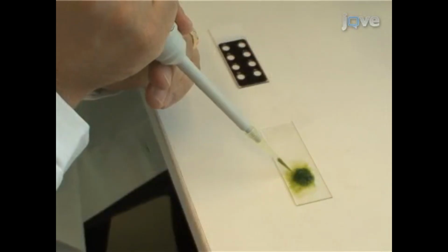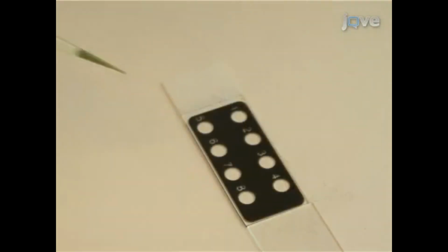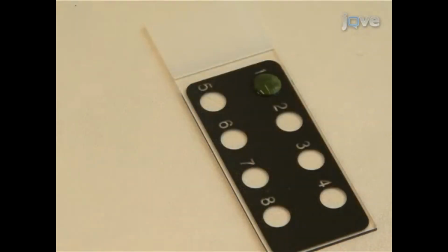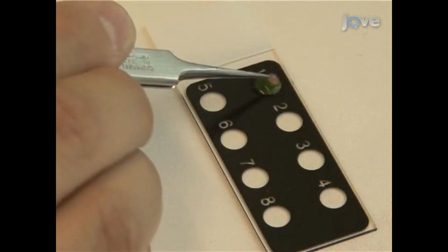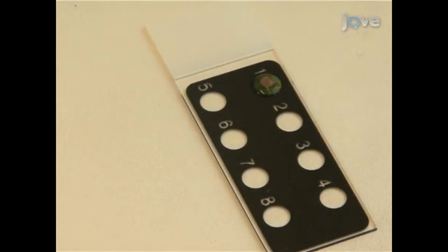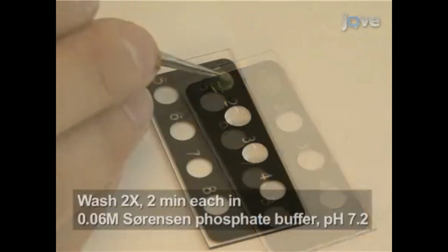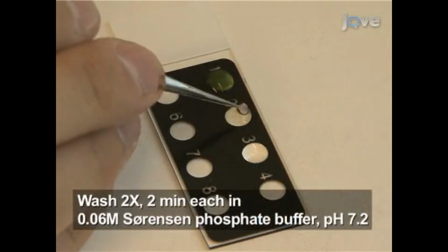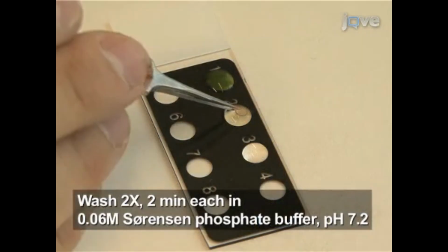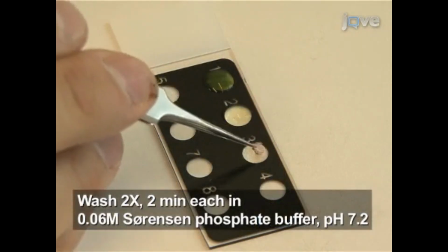Transfer 20 microliters of the resulting homogenate onto the first well of a Teflon-coated microscope slide with 4 or more wells. Then, place a formvar-coated grid on top of the homogenate with the formvar-coated side facing towards the drop. Incubate for 5 minutes. Wash the grid for 2 minutes by placing the grid on top of a drop of Sorensen phosphate buffer. Repeat the wash for another 2 minutes.